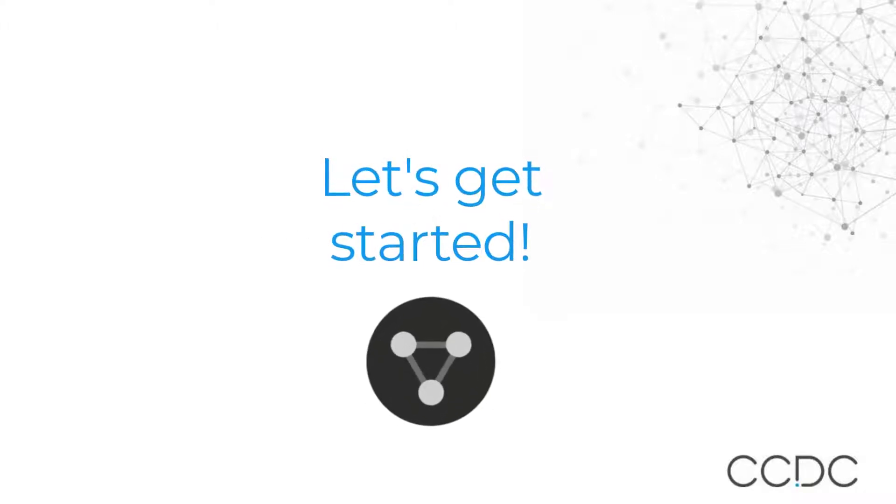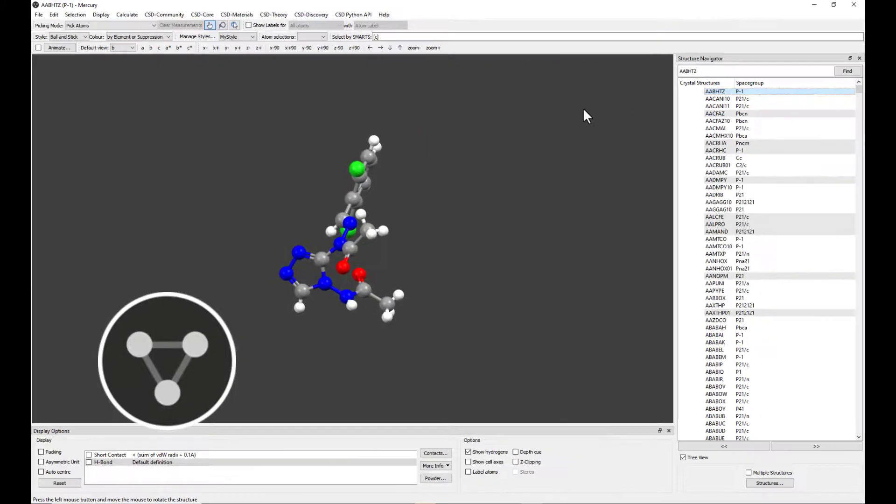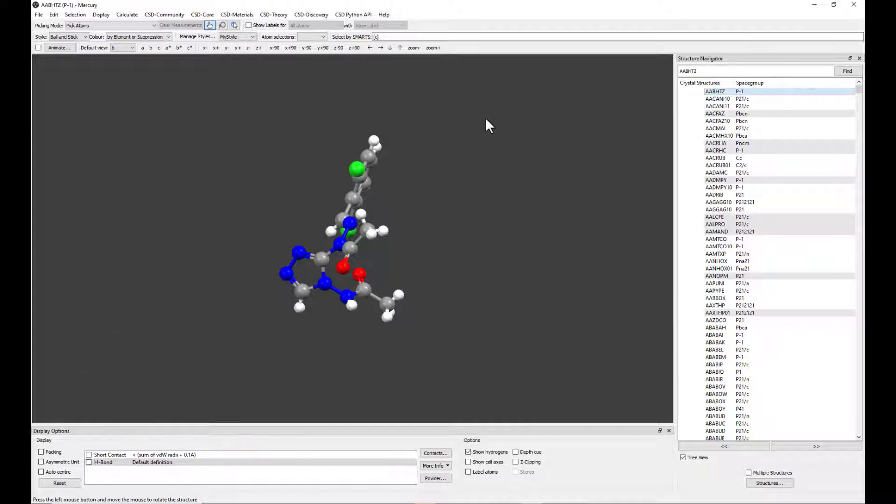Let's get started. First of all, let's open Mercury from the desktop icon or from the CCDC Applications folder. In this example, we will use a structure of pyridoxine, a form of vitamin B6.